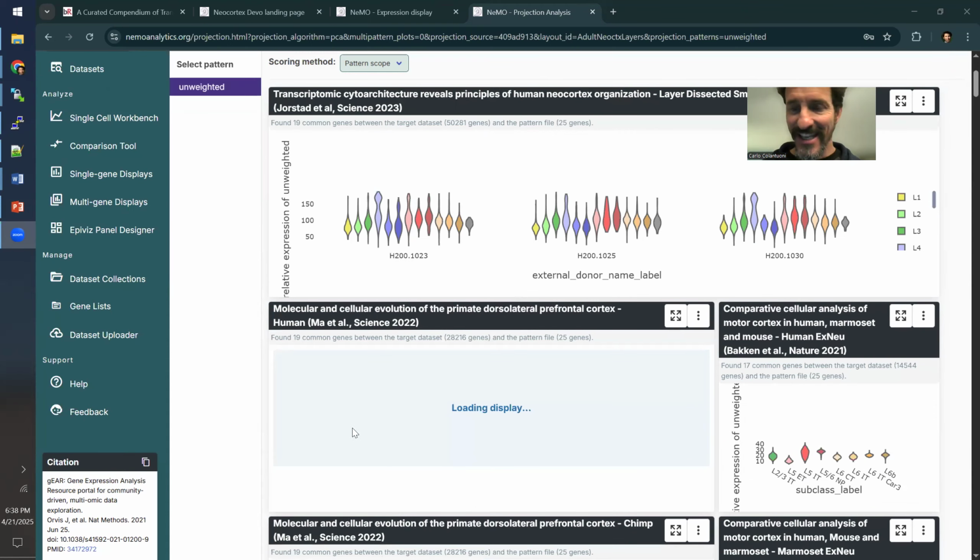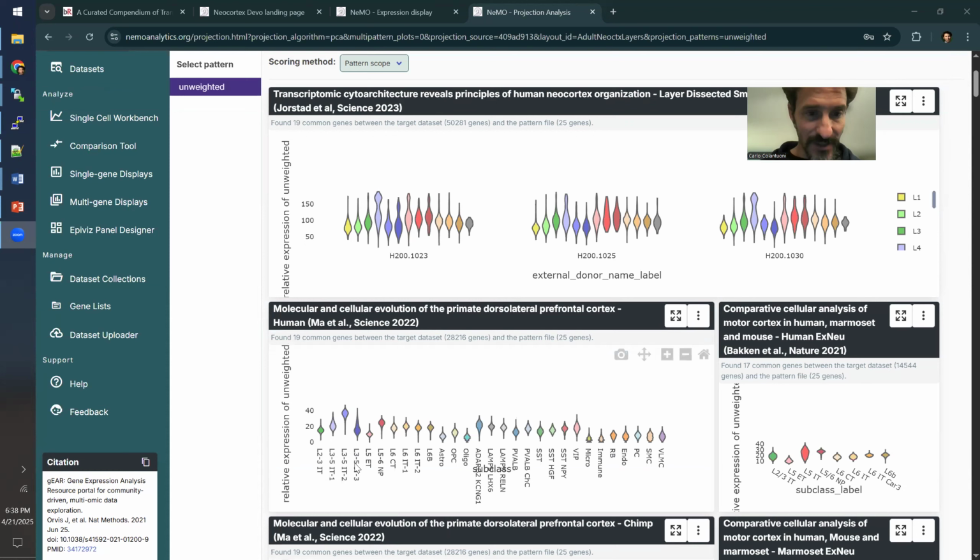It's high in the neuronal subset that we chose to grab the gene list from, which is here, this one, the layer 3 to 5, IT-2, and lower in the two that are very close to it that we contrasted it with. The other data sets, this is the Jorstad 2023. This results in identifying a subpopulation of one of their layer 4 identities up here.